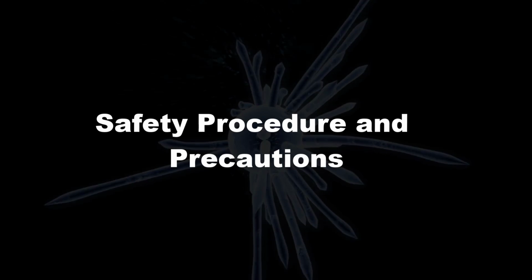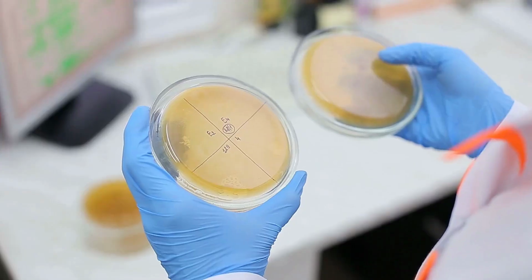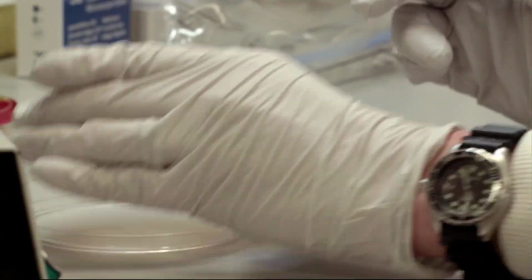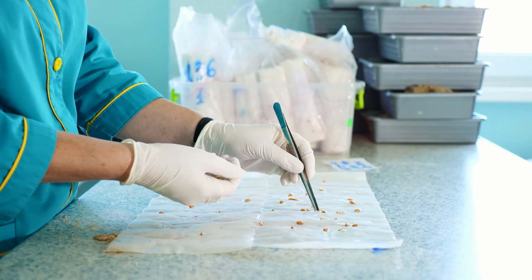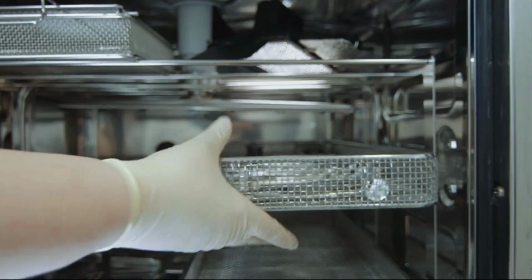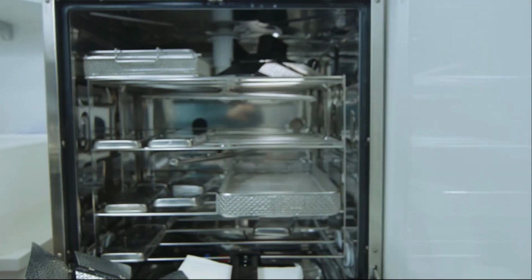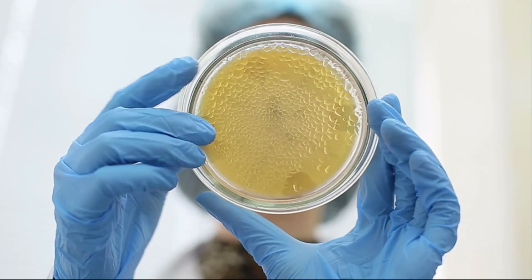Safety procedures and precautions. The microbiology laboratory, whether in a classroom or a working diagnostic laboratory, is a place where cultures of microorganisms are handled and examined. This type of activity must be carried out with good aseptic technique in a thoroughly clean, well-organized workspace. In aseptic technique, all materials that are used have been sterilized to kill any microorganisms contained in or on them, and extreme care is taken not to introduce new organisms from the environment.